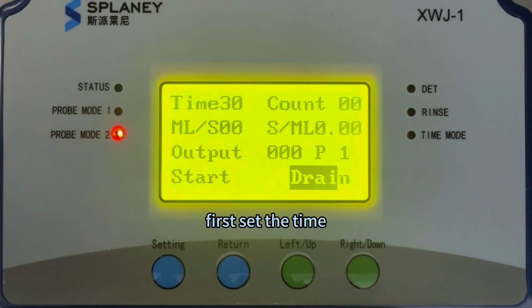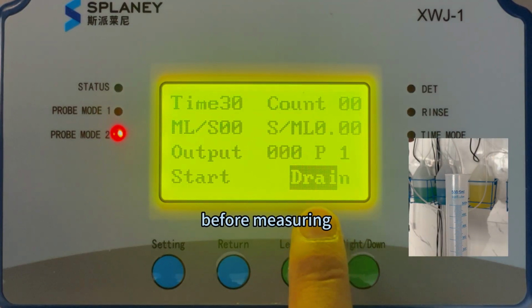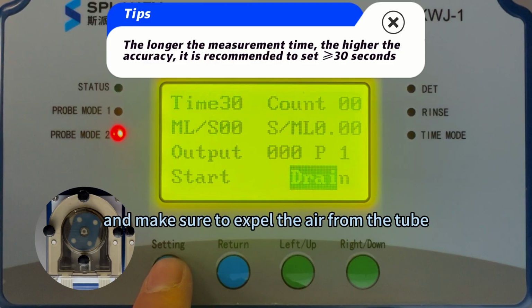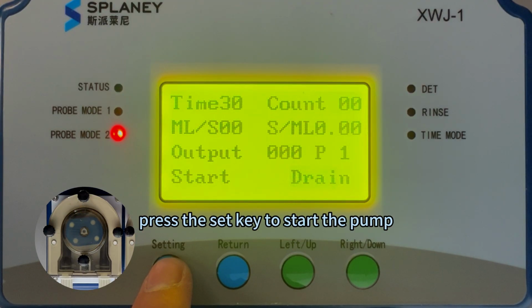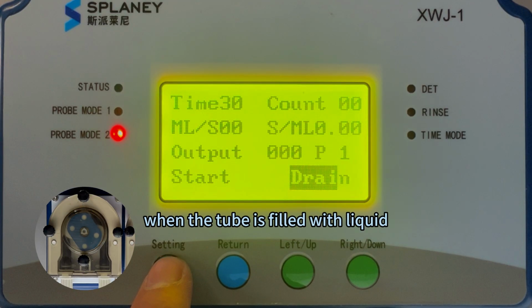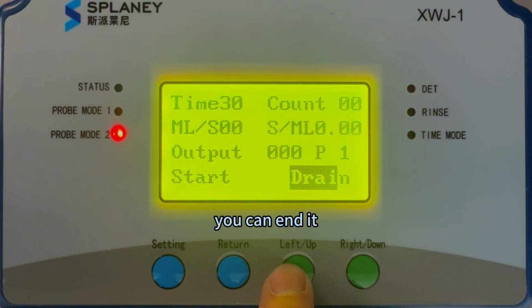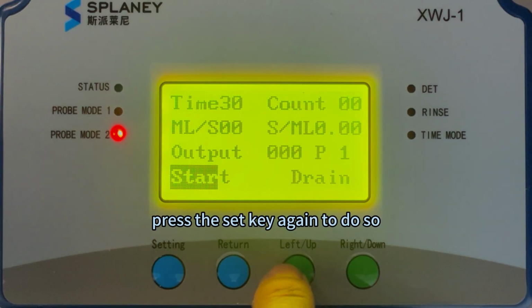First, set the time, confirm by pressing the set key. Before measuring, place the suction tube into the measuring cup and make sure to expel the air from the tube. Press the set key to start the pump. When the tube is filled with liquid and all the air is expelled, you can end it. Press the set key again to do so.